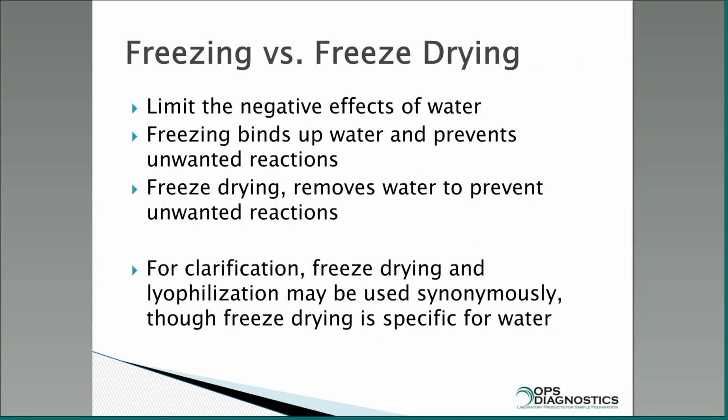Okay, just another quick point is you have freezing versus freeze drying. In both cases, what we're really trying to do is limit the negative effects of water. So when you have water present in a biological sample, all kinds of things can go wrong. You can have enzymatic degradation. You can have free radicals forming. That can just destroy your sample. So in the case of freezing, you bind up water in ice. In the case of freeze drying, you remove the water.